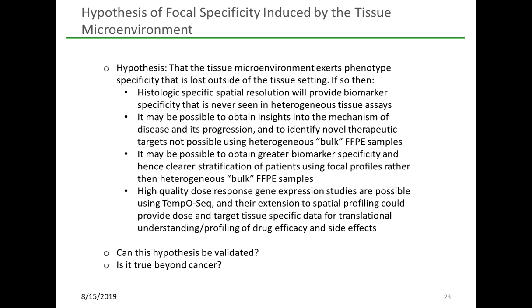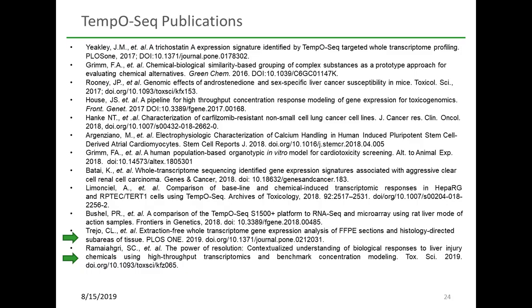So, of course, we have the questions: can we validate the hypothesis, and is it true beyond cancer? For Tempo-Seq, there's a fair number of publications. What I would like to draw your attention to are the two at the bottom. The fixed tissue assay has been published, not the spatial profiling assay, but the bulk assay.